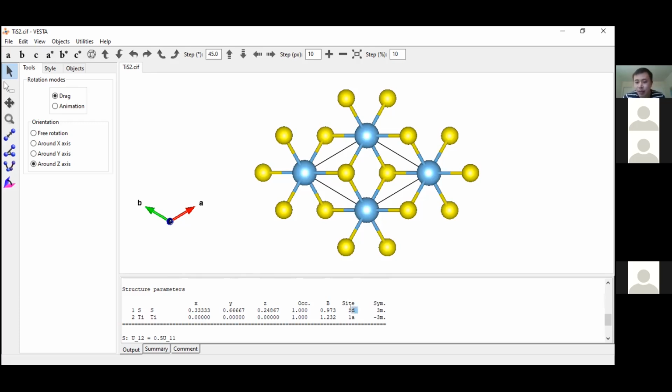So that's why it has 2. And d is simply a letter to differentiate from other sites that also happen to have a multiplicity of 2. For example, you can have another site which also has multiplicity 2, but it will be denoted as, for example, 2a or 2b and 2c. So it's basically a differentiation.